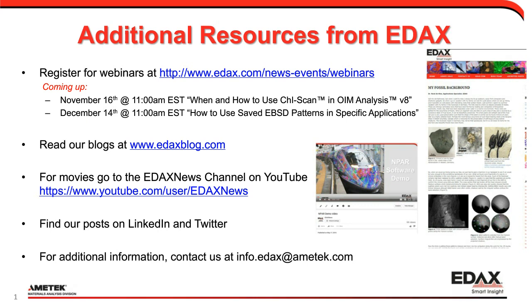Okay. On the hair spectrum from the polymer window showing digitization, I think what that means is that the spectrum appeared to be rougher. The reason the spectrum looked rougher in the polymer window was because it had lower signal. The two spectra were scaled on the same scale. Because the polymer window had less intensity, it had to be scaled up, and that's why the digitization is greater appearing in the polymer.